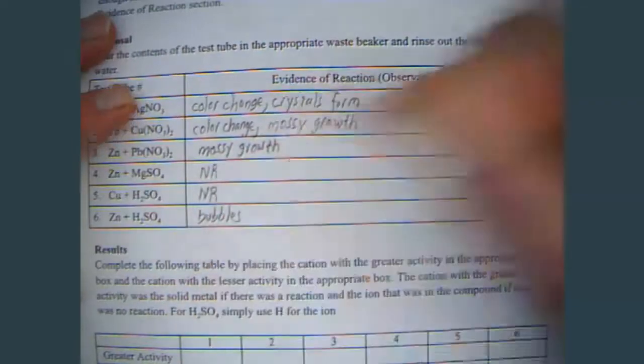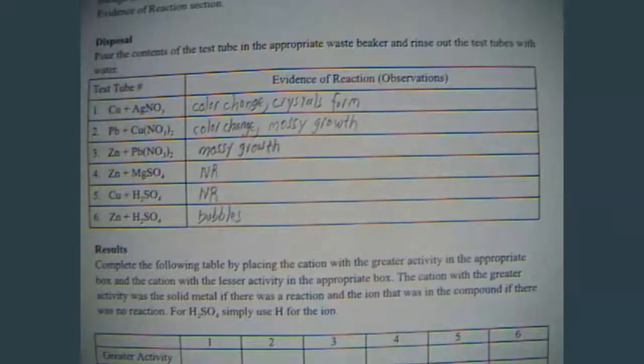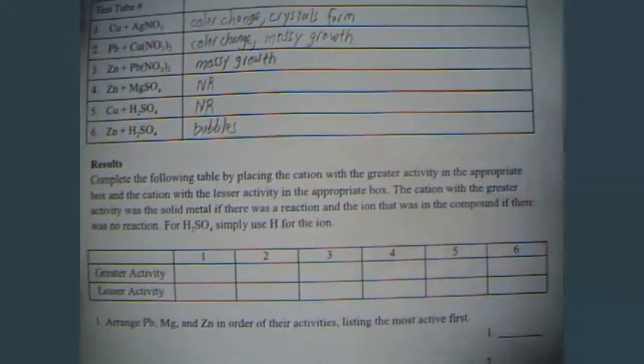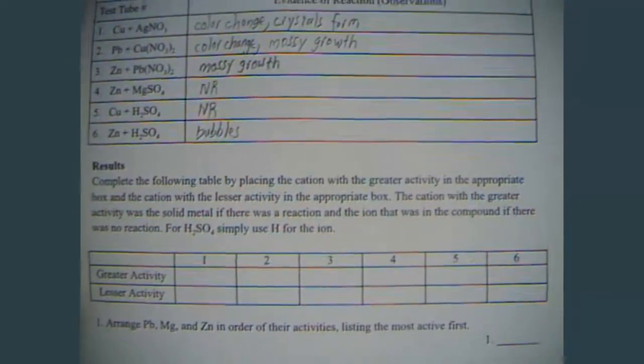And, the bubbles continued. So, that's why we're pretty sure that's a chemical reaction and not a physical reaction. Just that when I poured it in, there were extra bubbles in the urn and they came out of the solution, kind of like carbonated pop.